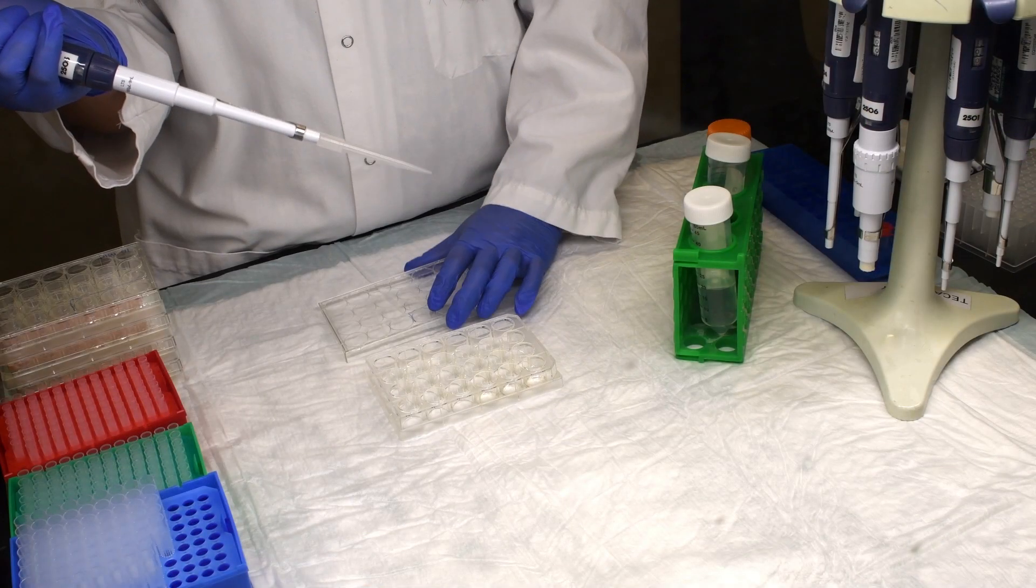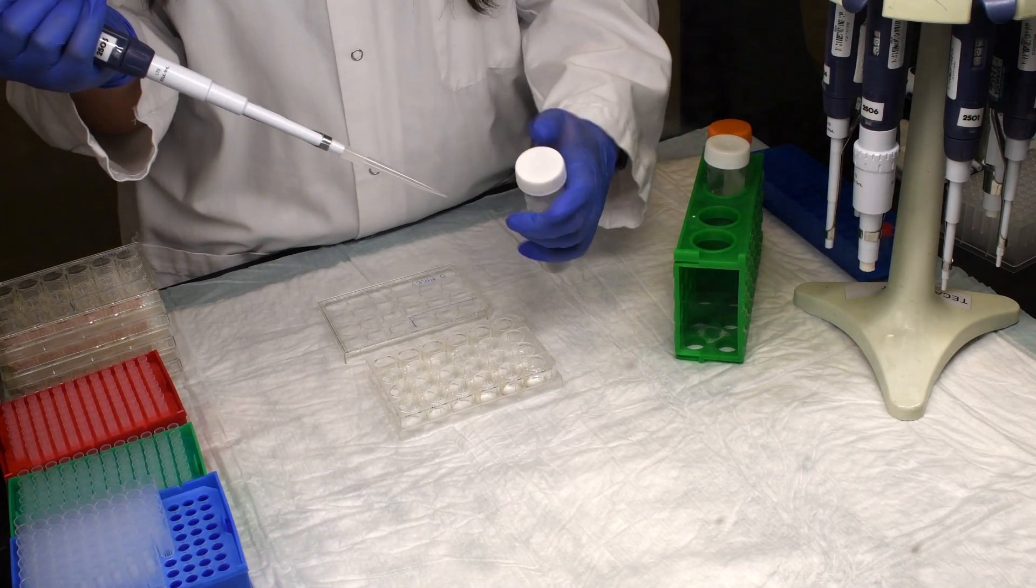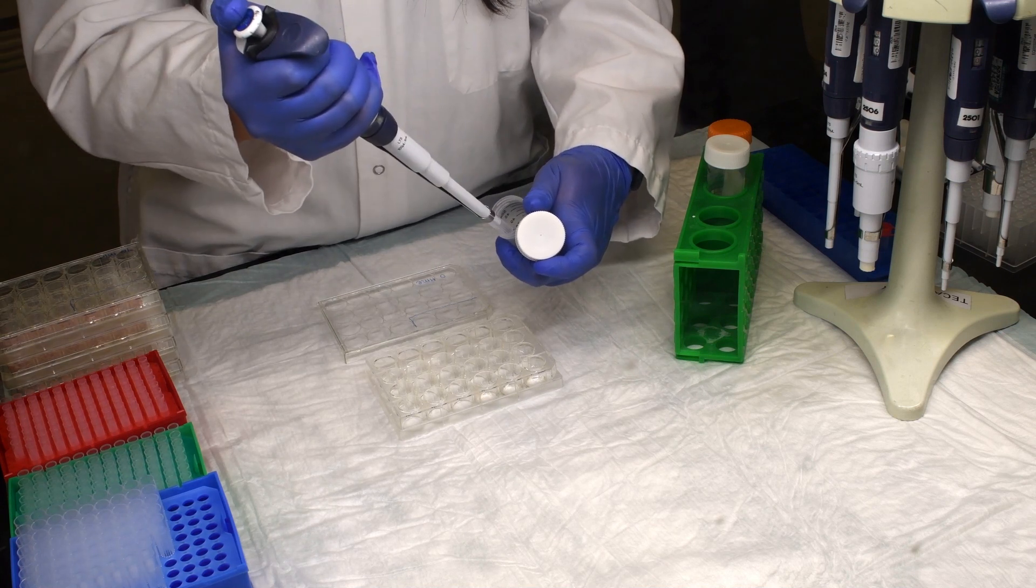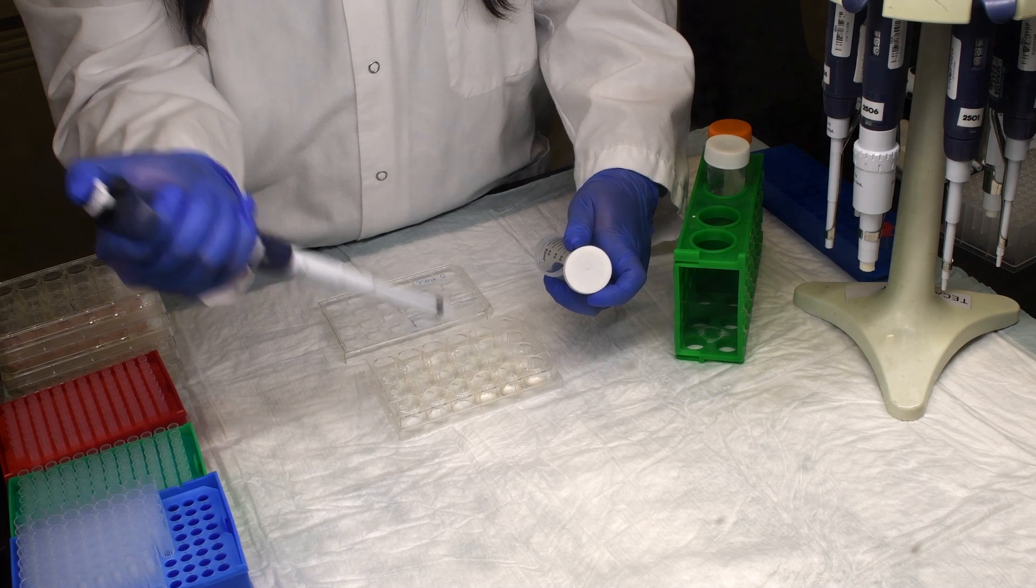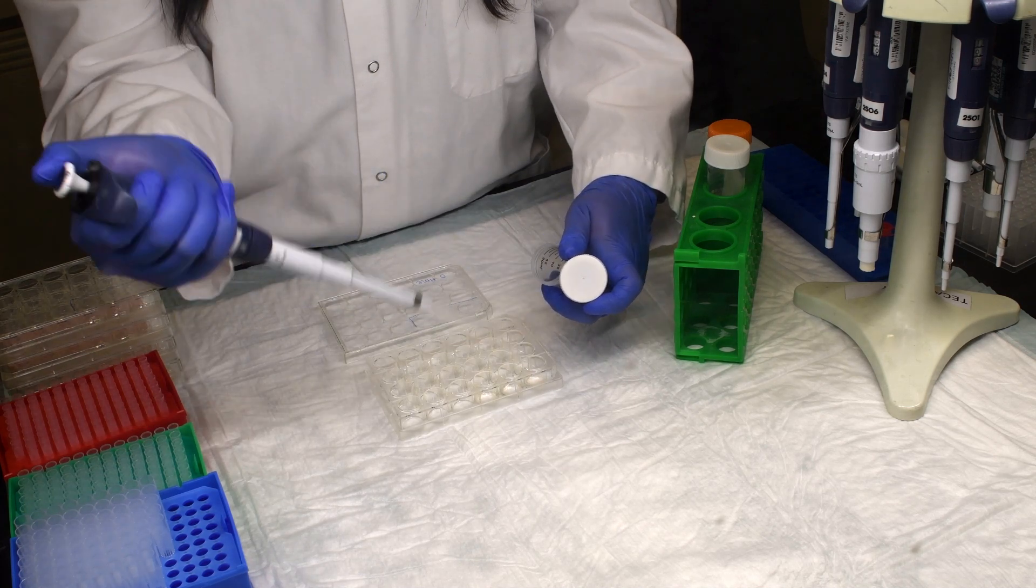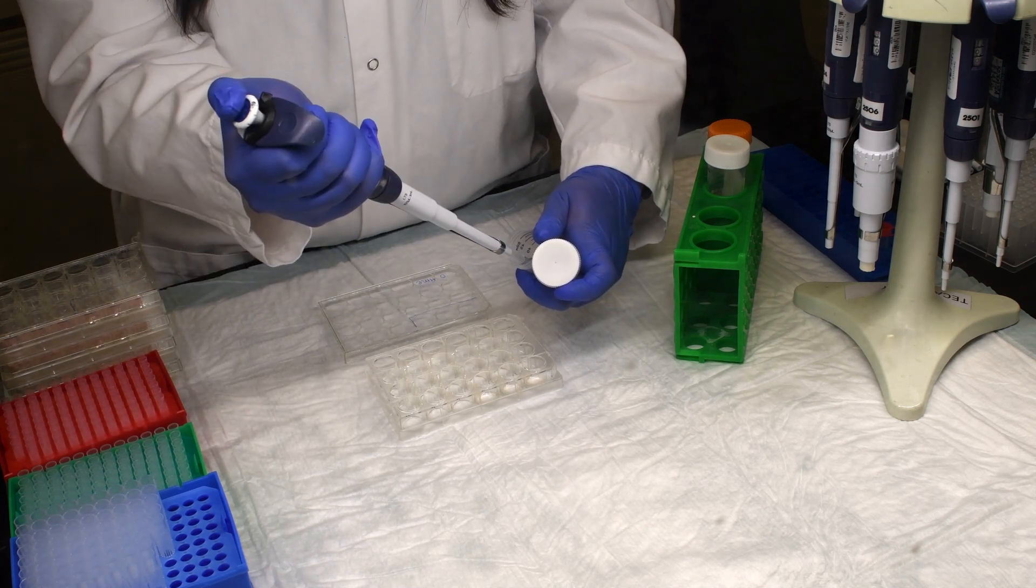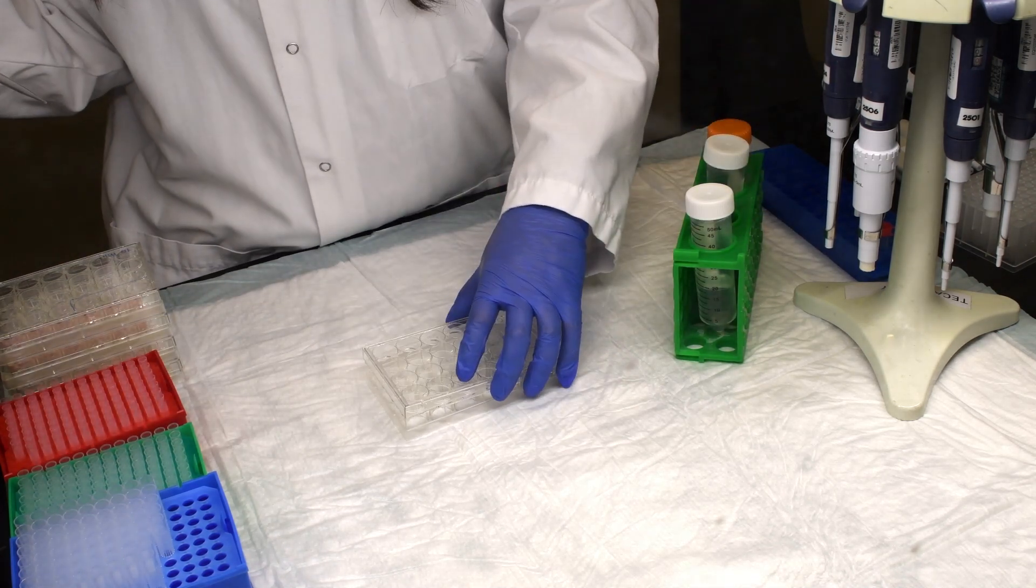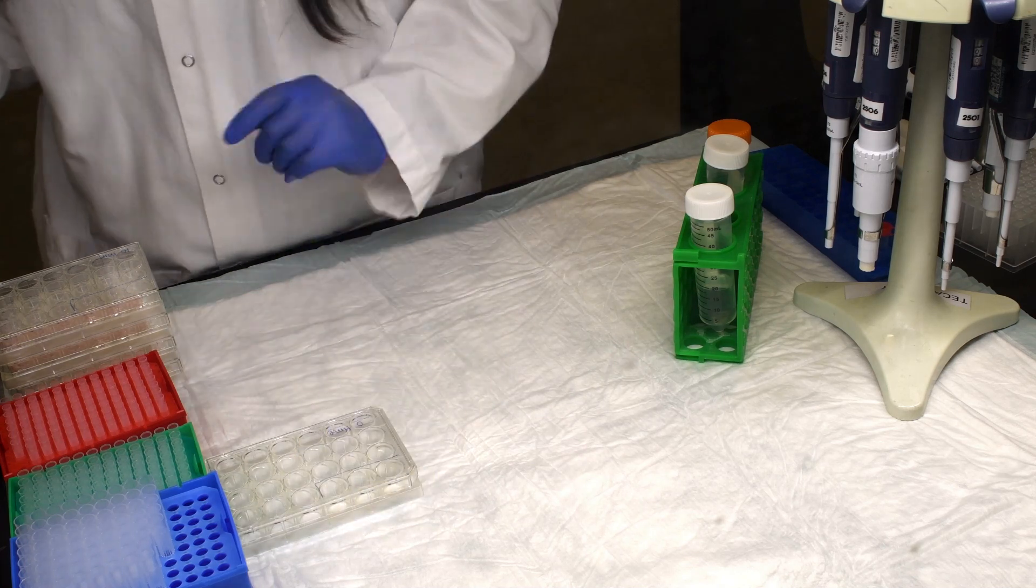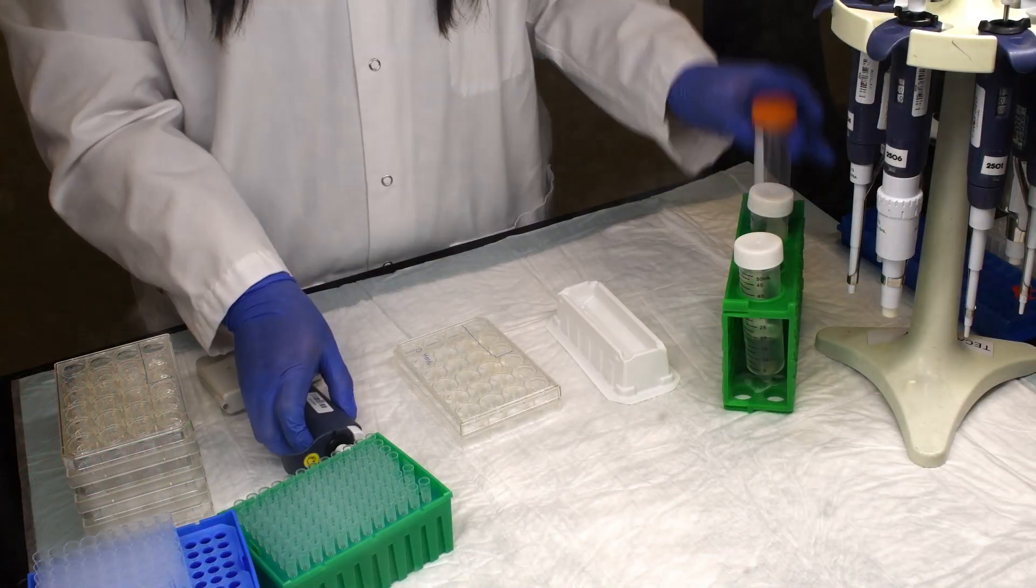For the zero time point, we would recommend adding the stop solution to the plates prior to the addition of the hepatocytes. This will lead to the lysis of the cells immediately upon addition and inhibit any metabolism of the test article. This is especially advantageous if the test article is metabolized very quickly, and in some cases, the stop solution cannot be added fast enough to stop the incubation before some metabolism occurs.